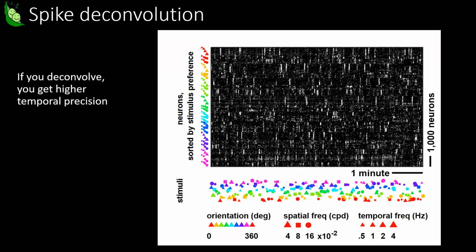Yeah, I see. I think no matter what, you have this issue. You can try binarizing in some way and see if you're able to do the correlation, and if it works. But you might be in a case where you'd get higher correlation in general if you are able to do the matching on these signals that have this continuous distribution. You might have higher correlation actually if you don't threshold it. So I don't know what your correlation matrices look like between them, but we're still experimenting.